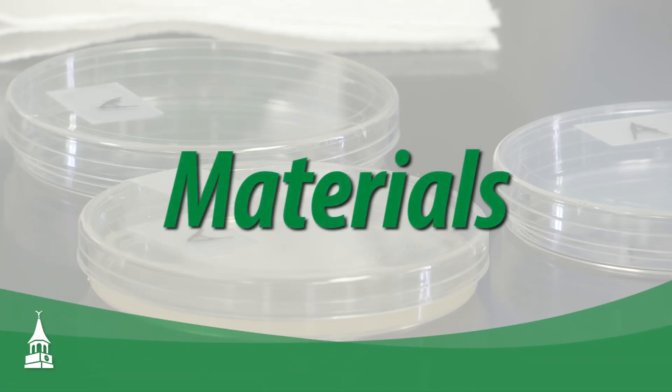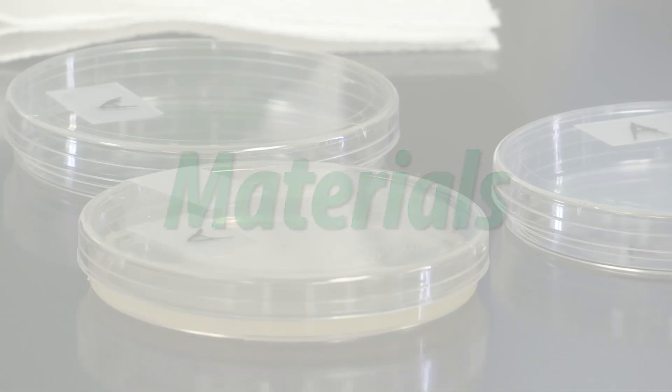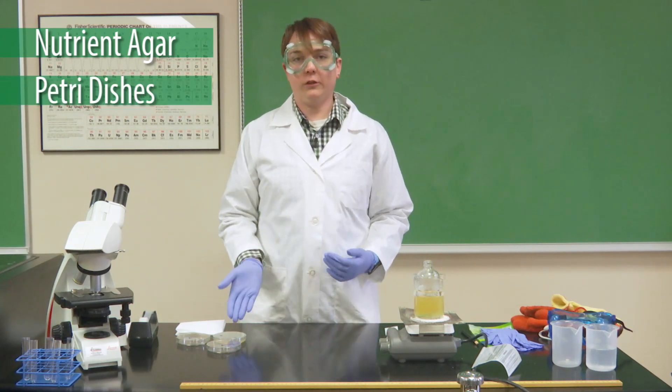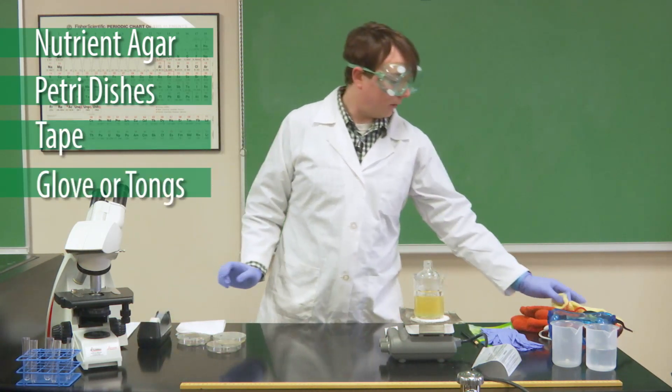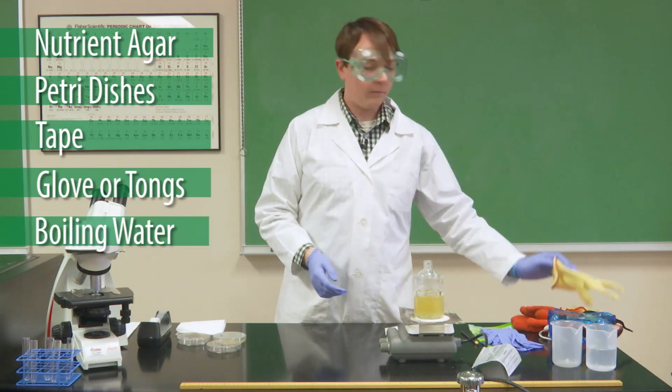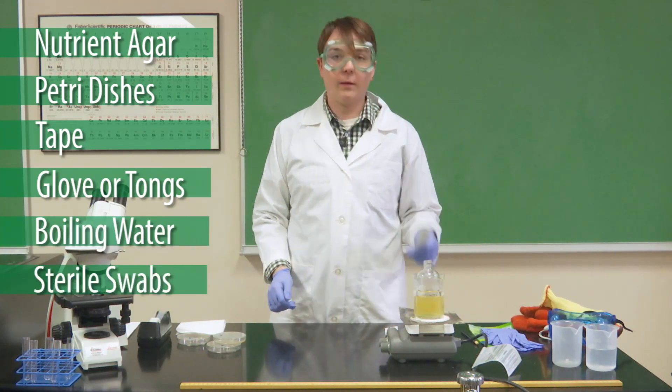The following materials are needed to set this up. We have nutrient agar, 10 petri dishes, tape, a glove to handle hot liquids, boiling water in a container, and sterile swabs.